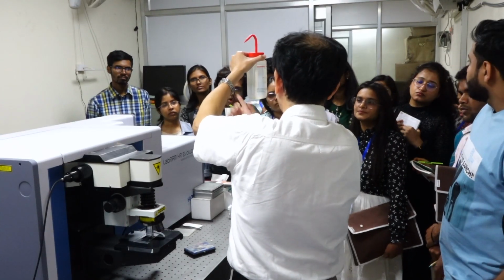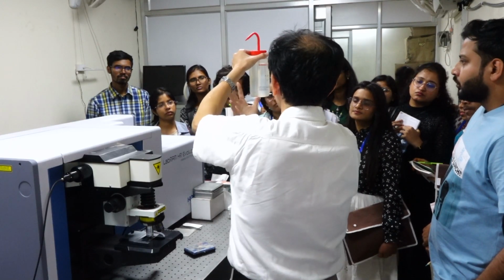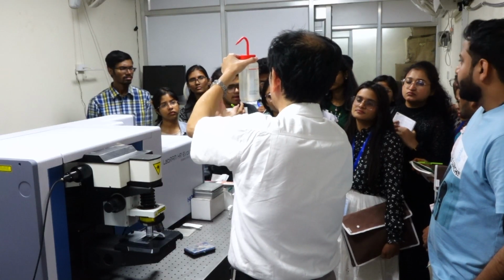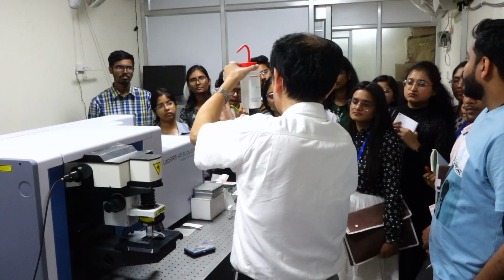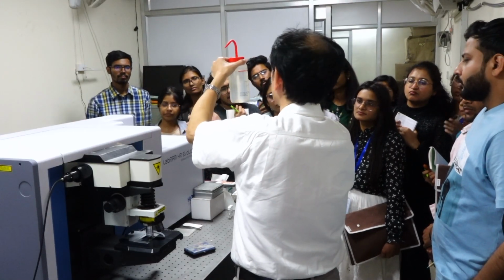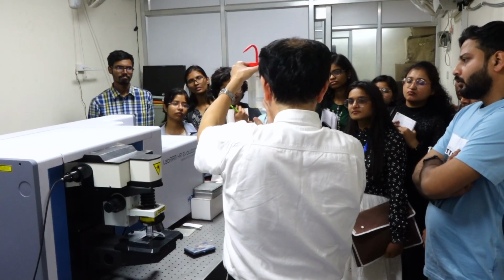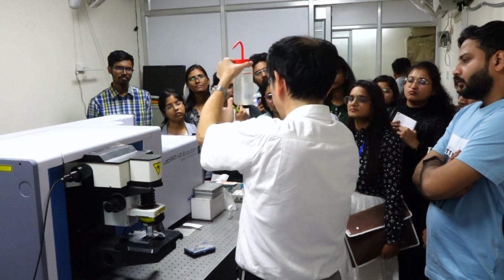Then we can avoid detecting the strong laser beam itself. But even when we measure at the side, there is Rayleigh scattering, and still it is the strongest. So we need to put a filter to eliminate the Rayleigh line. But anyway, in the typical measurement, we collect the signal at 90 degrees at the side.